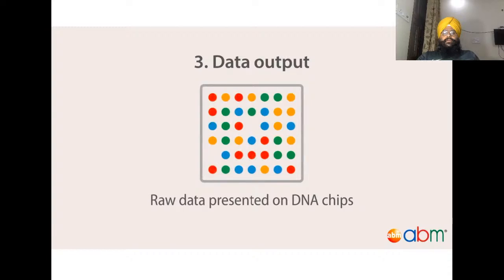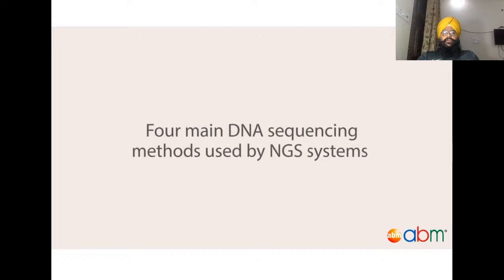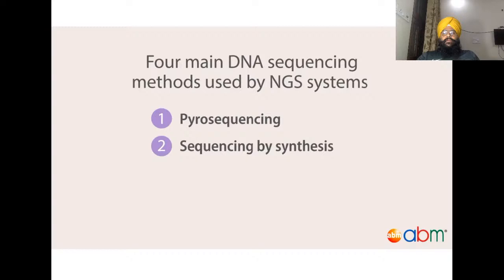The differences between the different next-generation sequencing platforms lie mainly in the technical details of the sequencing reaction, and can be categorized in 4 groups: pyrosequencing, sequencing by synthesis, sequencing by ligation, and ion semiconductor sequencing.